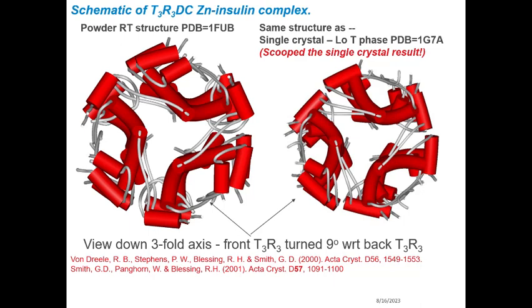And so I sent this off to my colleagues at the Hauptmann Woodward Institute in Buffalo, sent off a copy of the paper, and they came back with, "You scooped us," because they had encountered the same crystal structure in a single crystal study at low temperatures, and there's theirs, and there's mine, and they're, for all intents and purposes, the same.